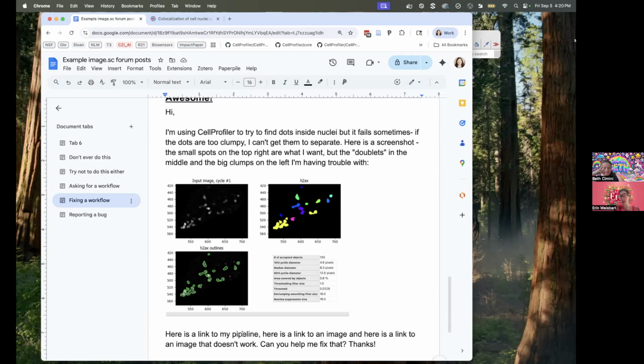Because there are biological tasks where maybe somebody actually does want that identified as a clump. So when you can specifically say, no, actually, I should be finding 8 individual dots here rather than this clump of signal, that can be really helpful for communicating even more directly. Draw it out yourself.